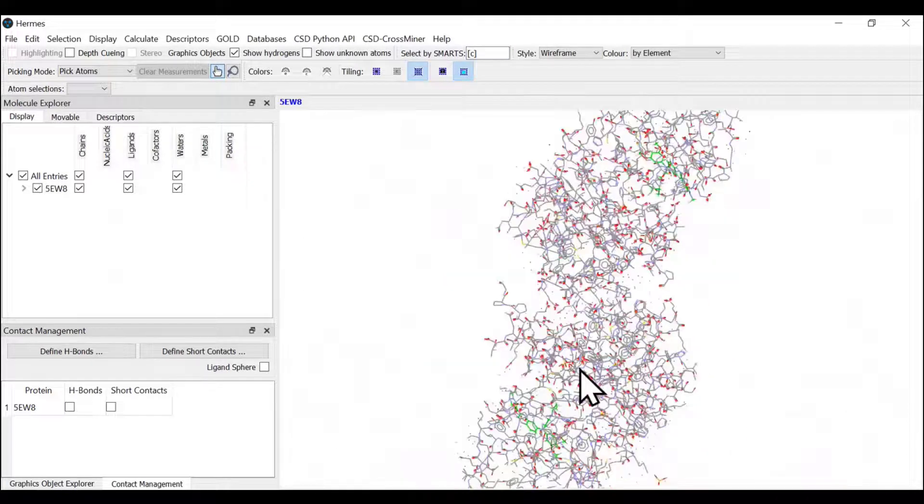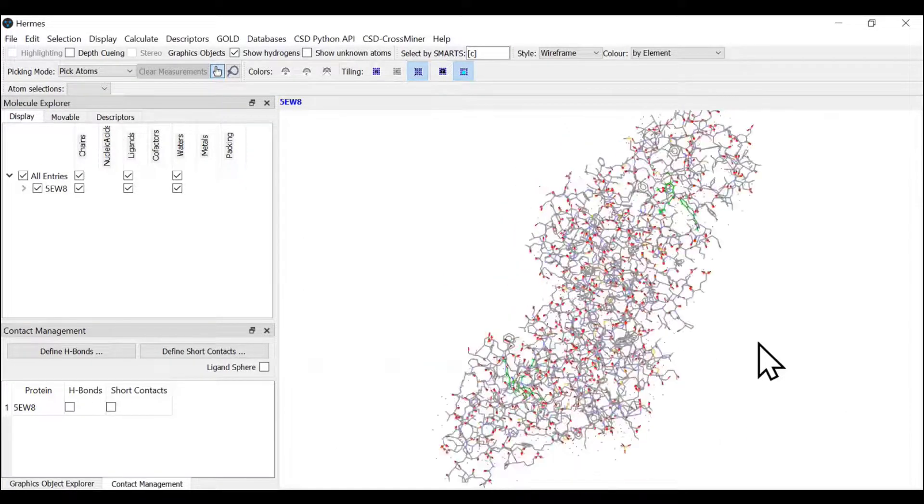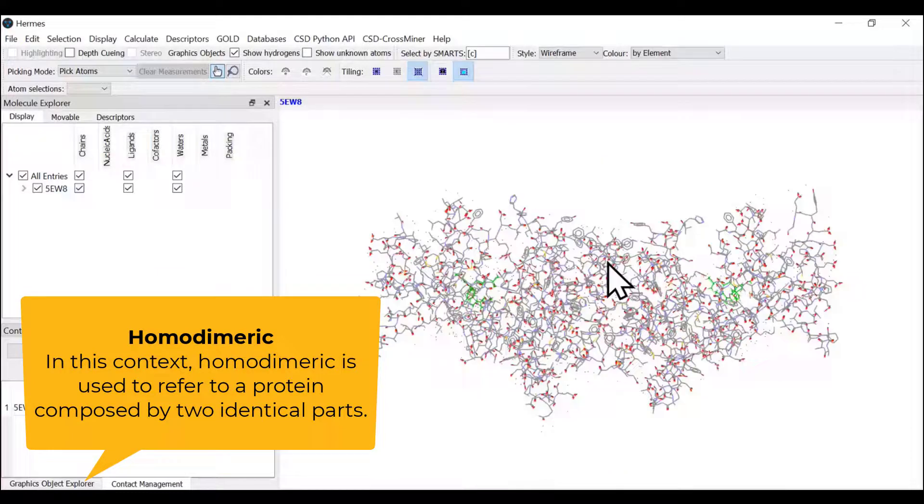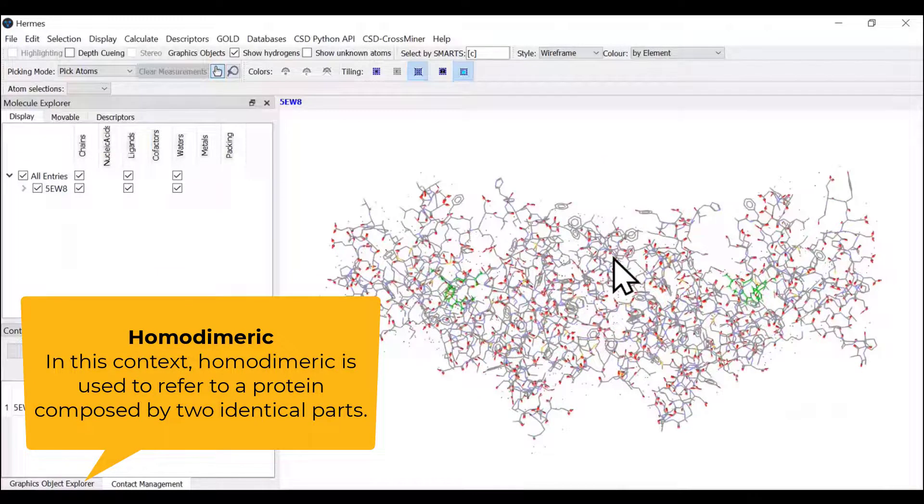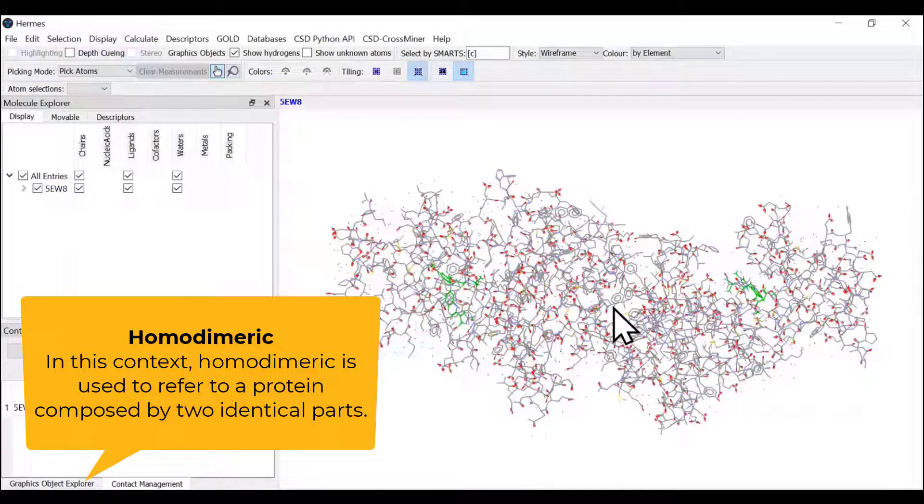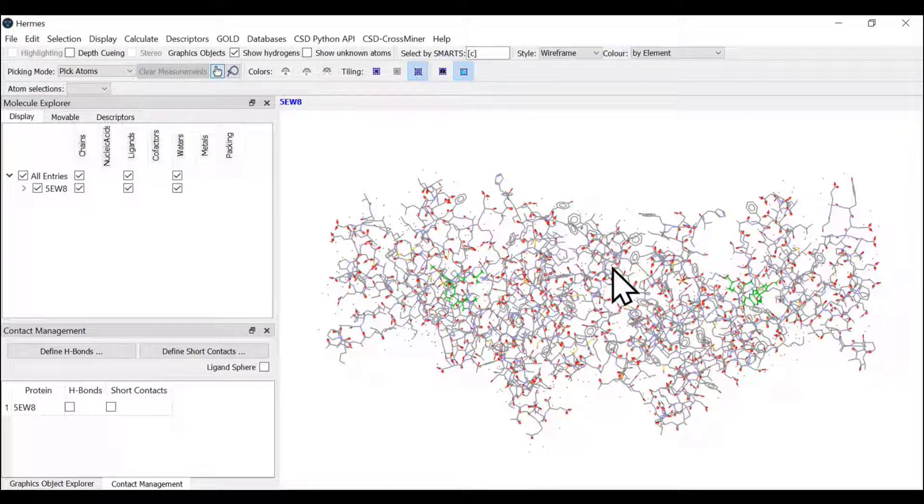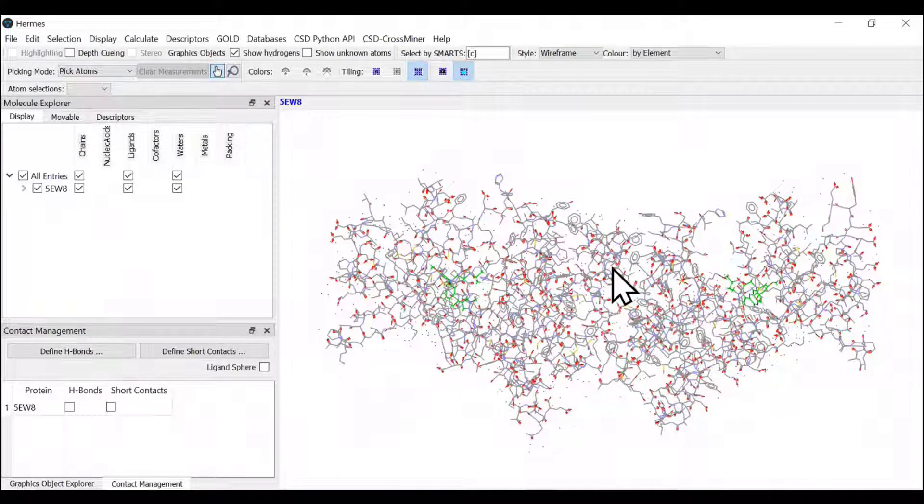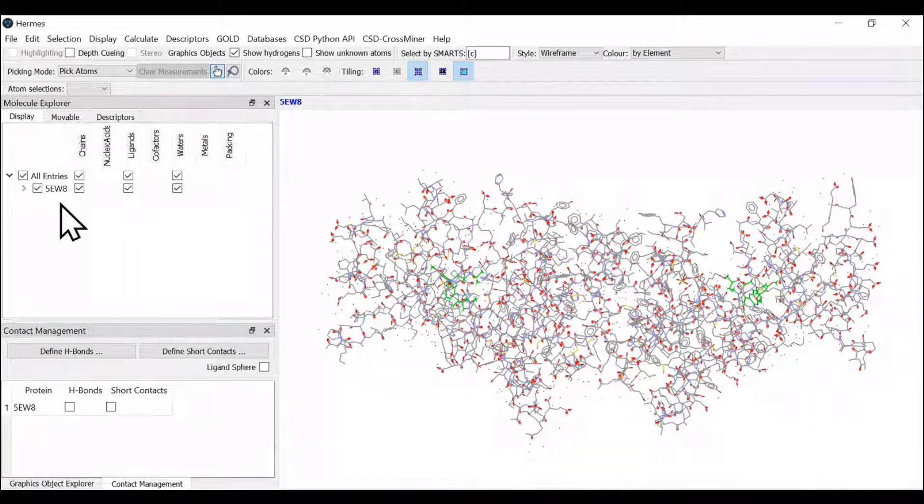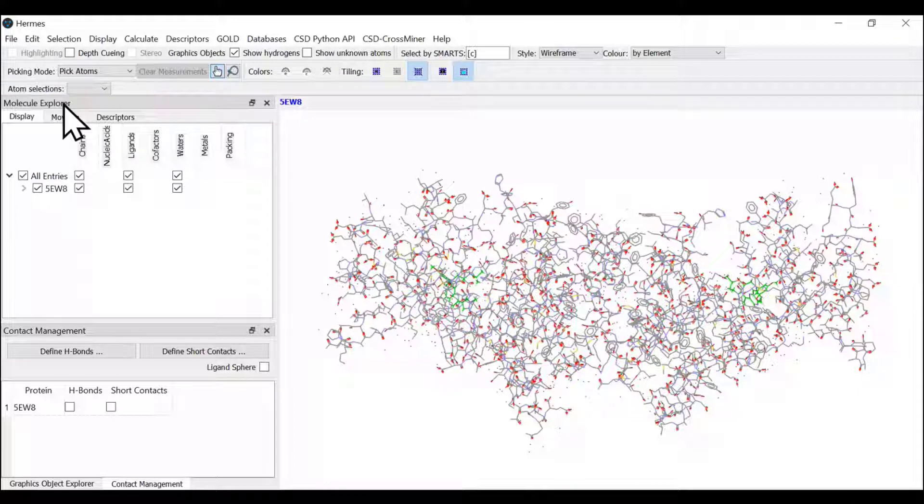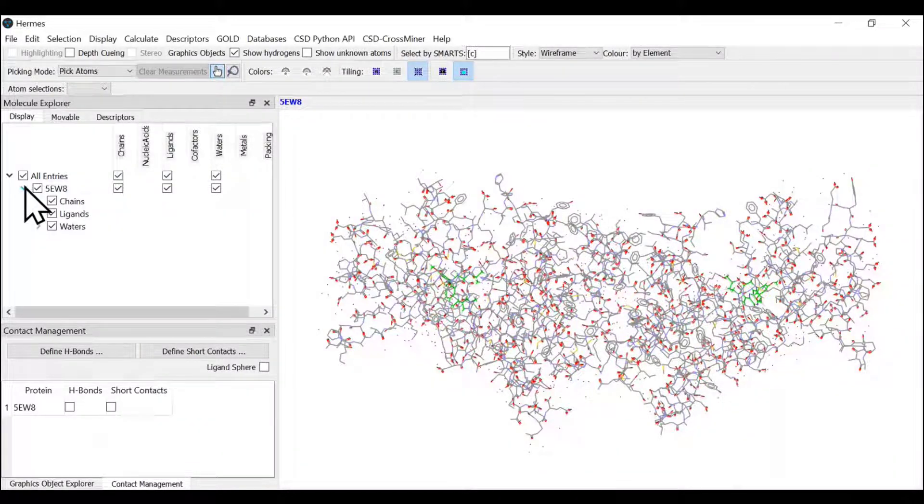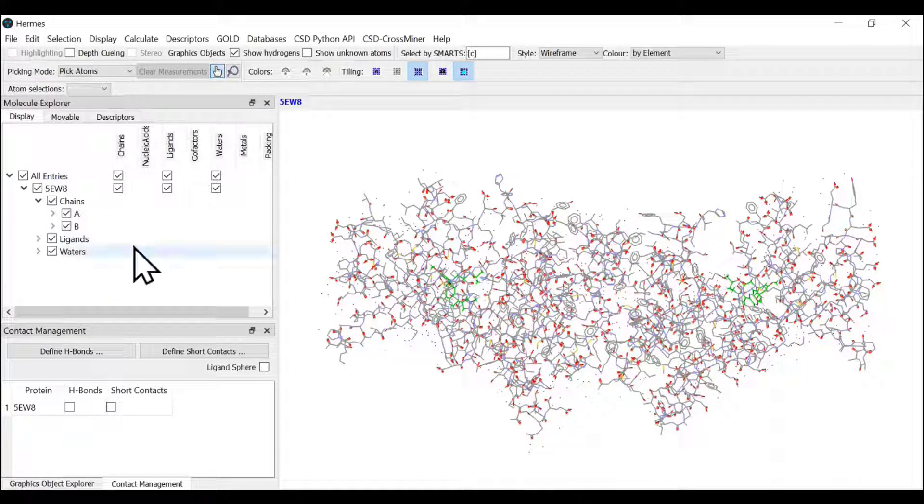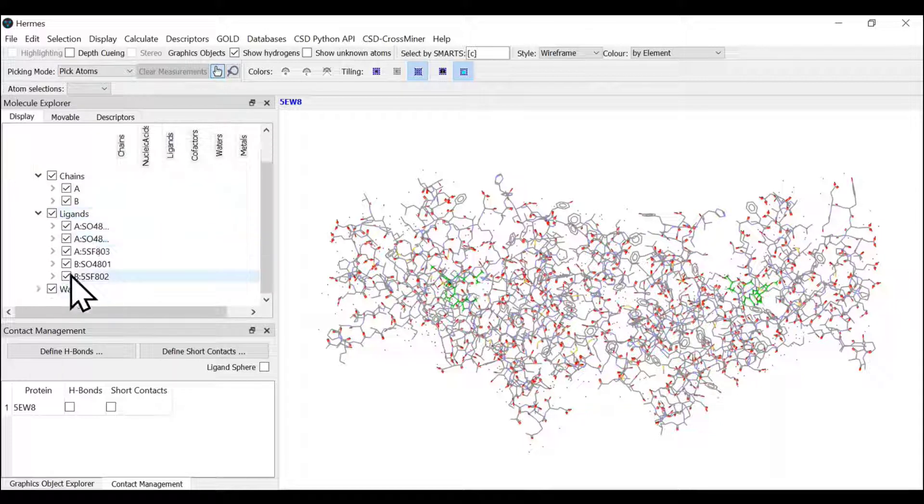This particular crystal structure is a homodimer where you have two kinase molecules with two ligand spots. We have to prepare this crystal structure before the GOLD docking calculation. On the left side, you see a molecule explorer window showing different chains present in the crystal structure.